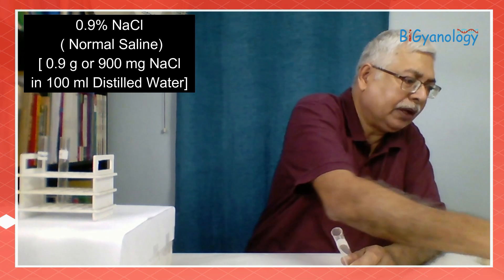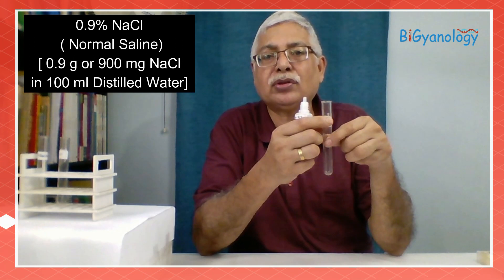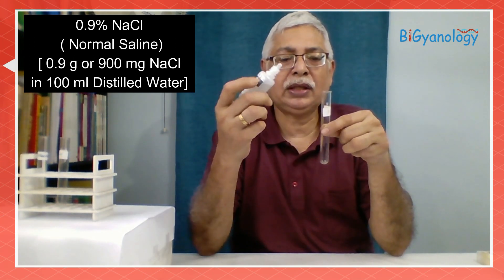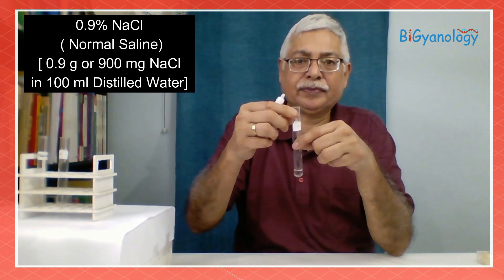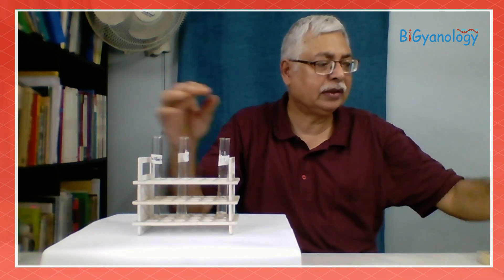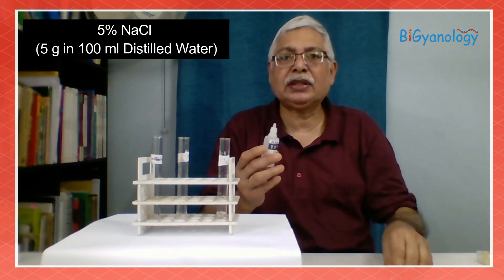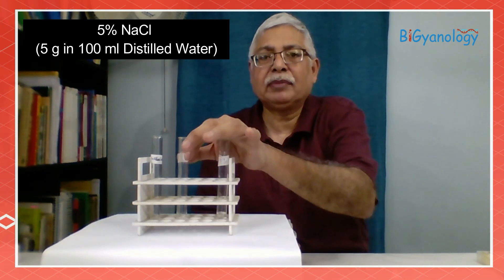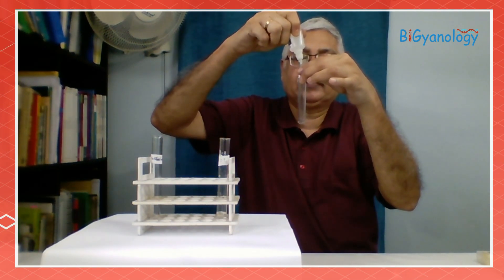In these three test tubes, in the first one with 0.9% NaCl, we have taken 0.9 gram of salt in 100 ml of distilled water and given here about 1 ml. Then in the second one, we are giving 5% NaCl which is 5 gram sodium chloride in 100 ml of water — about 1 ml.